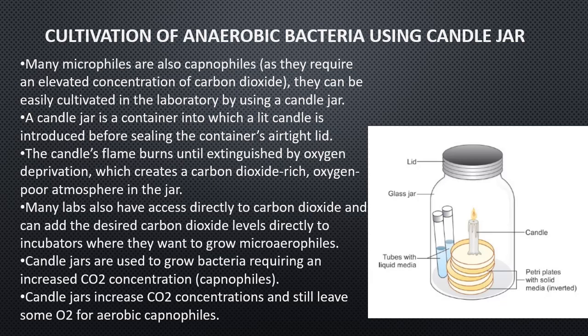Candle jars are used to grow bacteria requiring an increased CO2 concentration, and a candle jar still leaves some O2 for aerobic capnophiles. So a candle jar increases the CO2 concentration, but there is no guarantee that you will get zero concentration of oxygen.